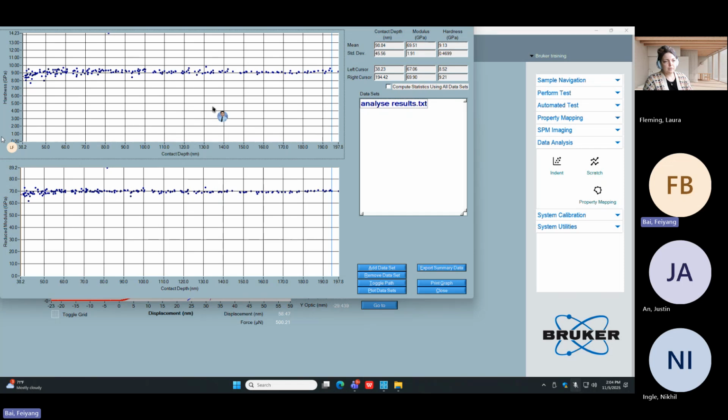I guess if we use it a lot, probably once a month, but if we haven't heavily used it, every couple of months. Yeah, it depends on the materials too. If you're doing soft, squishy stuff, what's probably more important is cleaning it, to be honest, because soft, squishy stuff can get coated on the side of the probe. Yes, so that's stuff to consider.